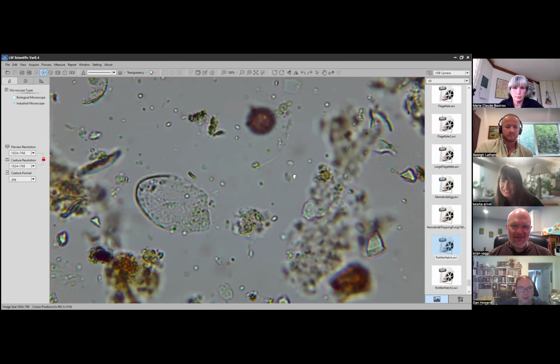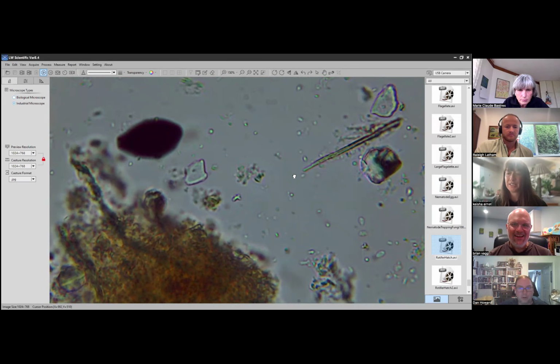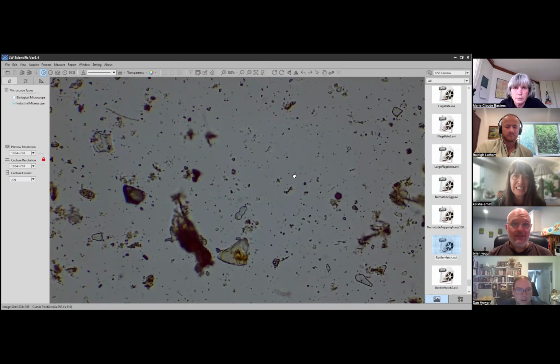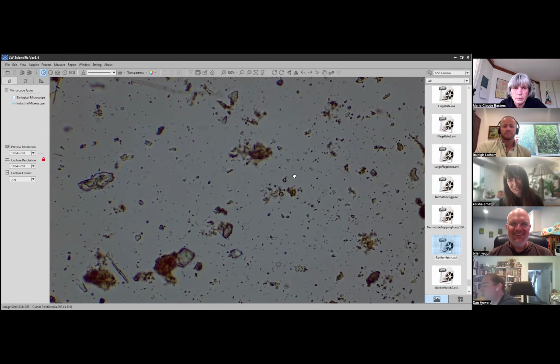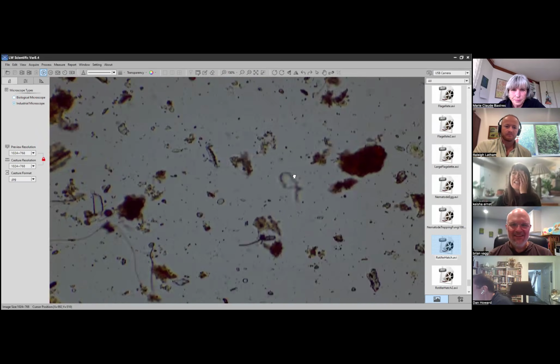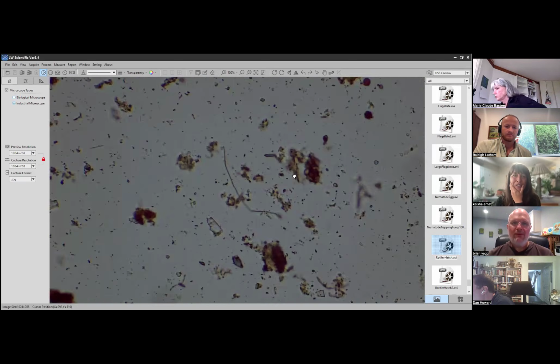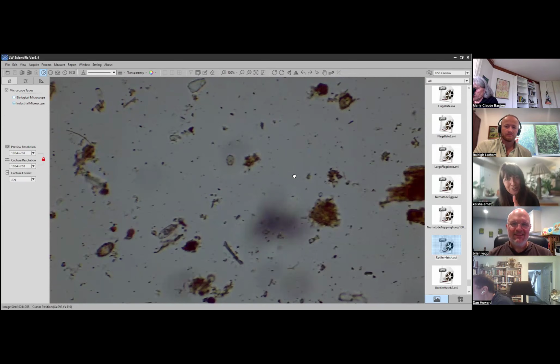Stacy, there's a few questions that came through. First, Rich asked, how much life is smaller than what we're seeing at this magnification? I think a whole lot, Rich. Archaea are smaller, some bacteria you can't see, viruses are super prevalent. We're basically just scraping the surface here. We can go in further. I know Matt's students are often loving the oil immersion or the dry 60x or 100x objectives, really going further into magnification.